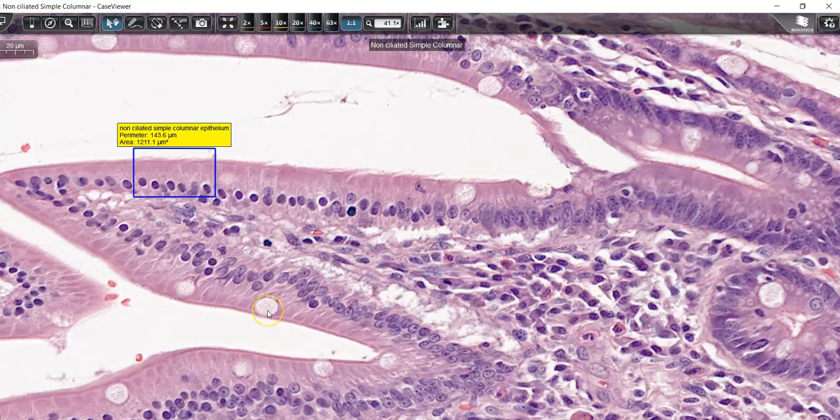If you recap the epithelial fold of gallbladder, it doesn't have the appearance of goblet cells.